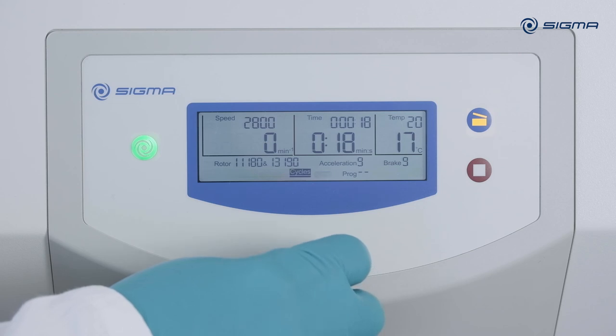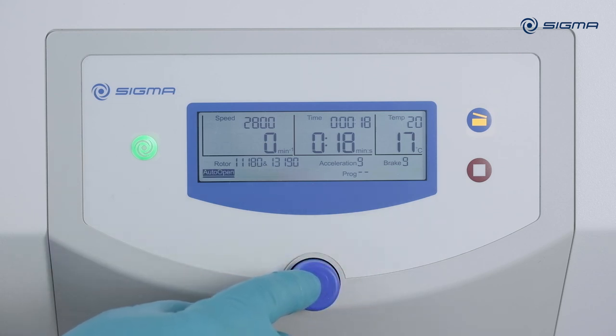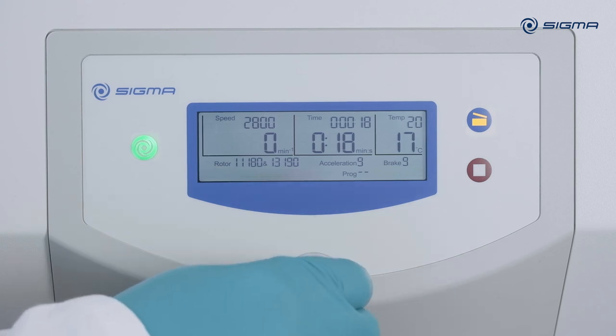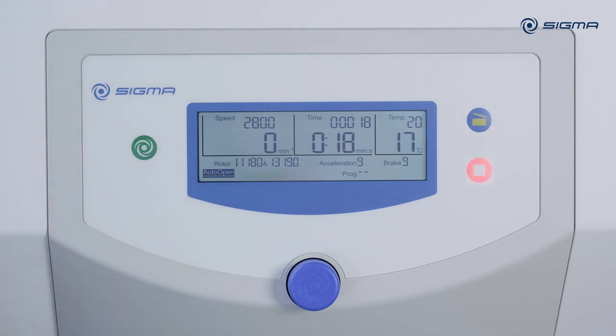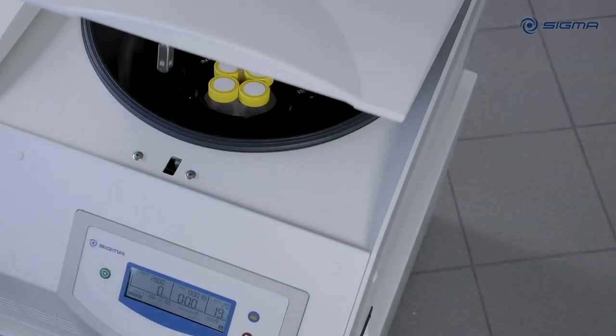You can enable automatic lid opening at the bottom of the menu. Press the knob, turn it, and then press it again, then press the start button to start the run. After the run is finished, the centrifuge lid will open automatically.